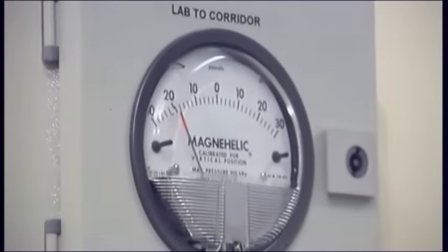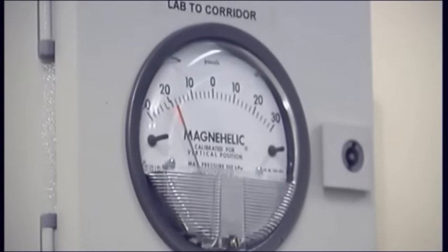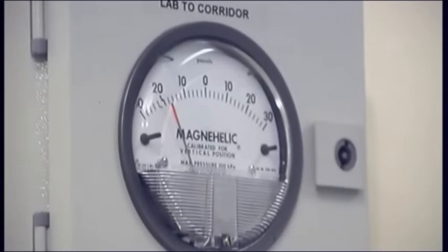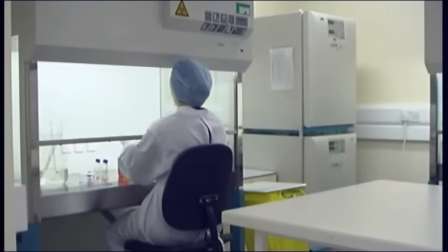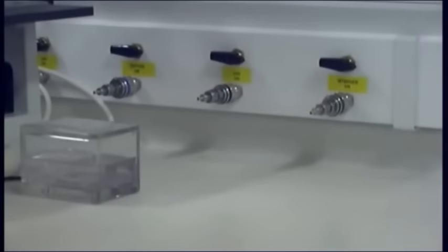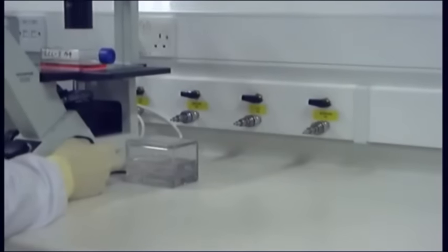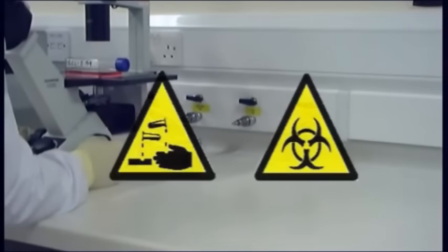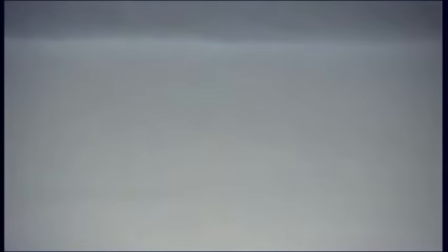At the European Collection of Cell Cultures, the cell culture laboratories are operated at a negative pressure to the environment. This acts to contain any potential contaminating aerosols. In order to maintain a clean working environment, the laboratory surfaces, including benchtops, walls and flooring, should be smooth and easy to clean. They should also be waterproof and resistant to chemicals. Floors and walls should be continuous, with coved skirting to make cleaning easier and reduce the potential for dust to accumulate.